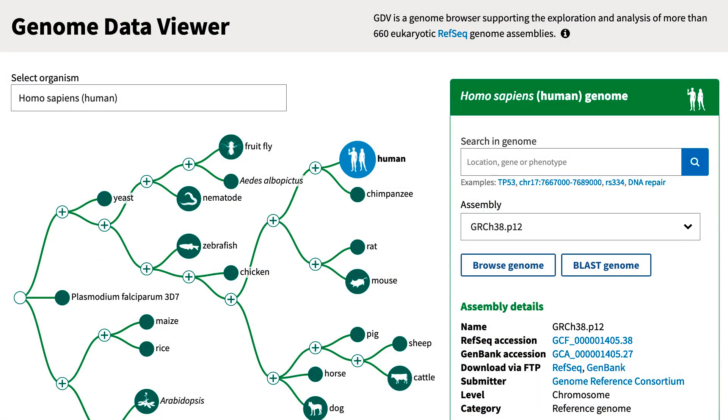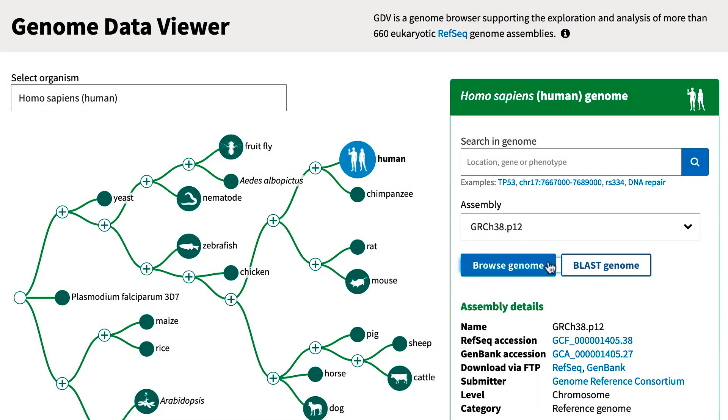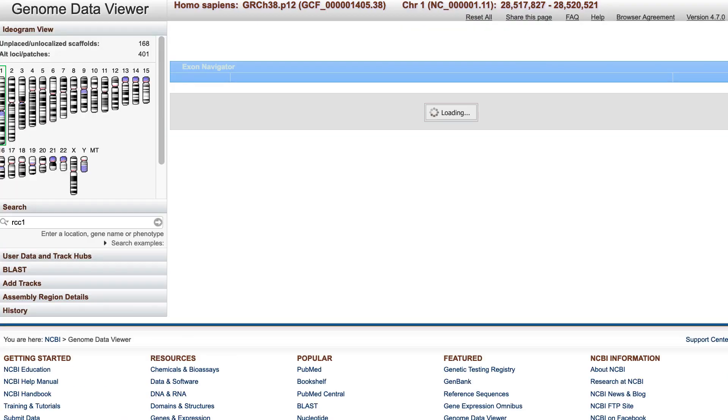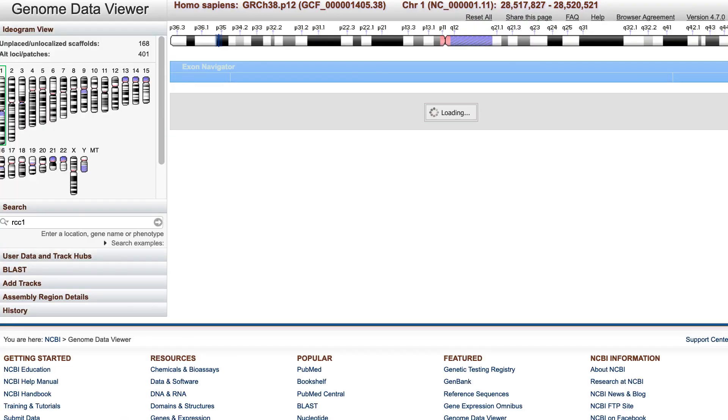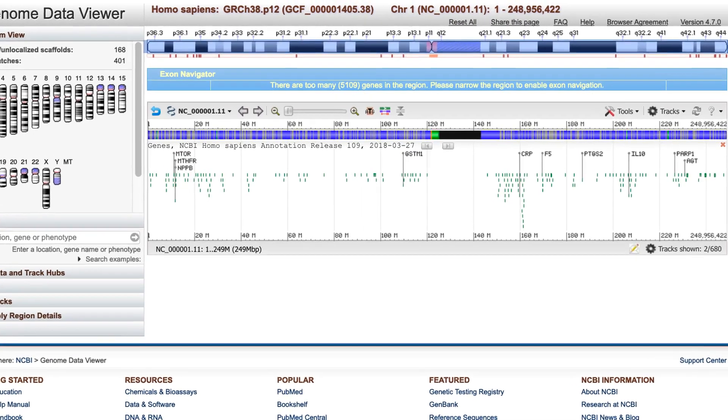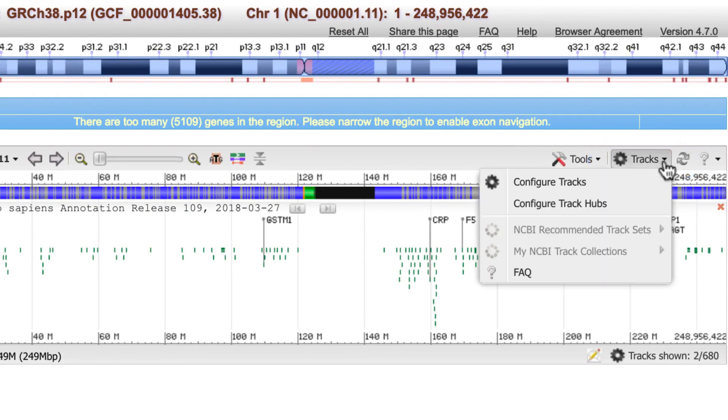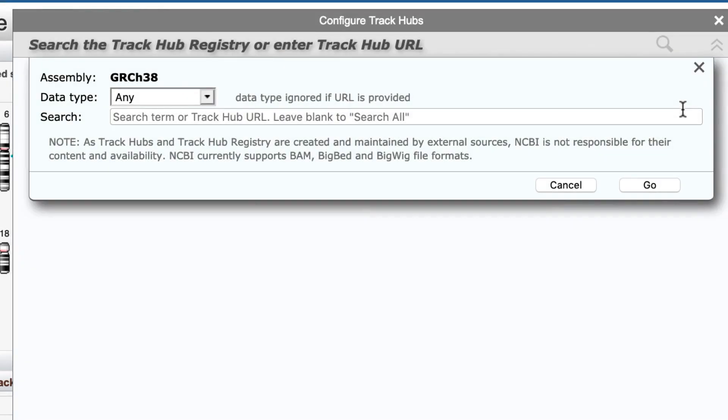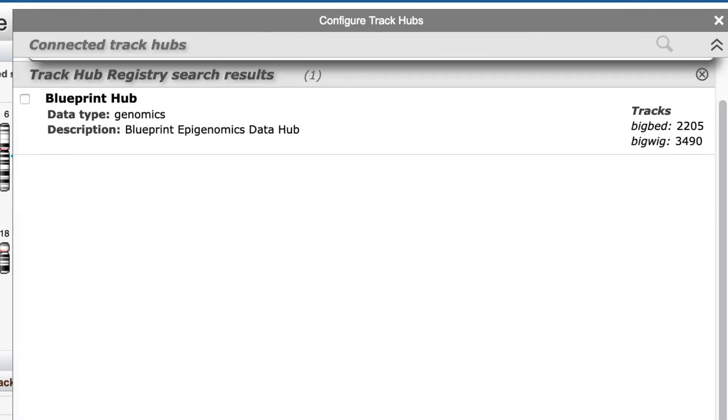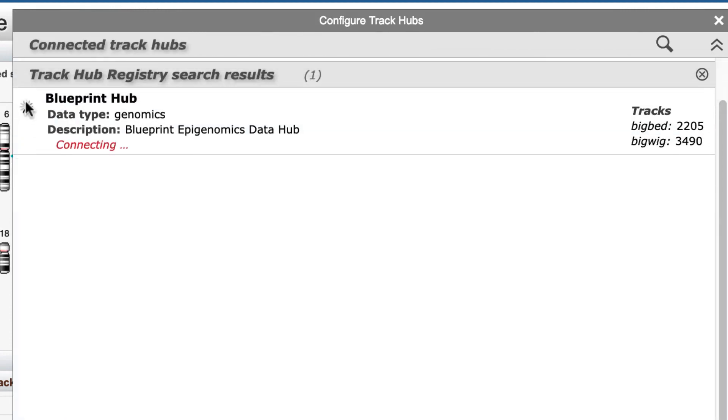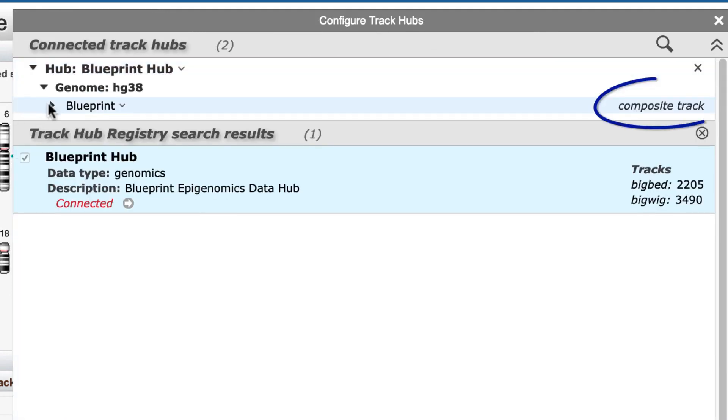Starting on the GDV home page, use the Browse Genome button to go into the current Human Assembly, GRCH38. Then in the Tracks menu, use Configure Track Hubs and connect to the Blueprint Epigenomics Hub, which you see is a composite track.